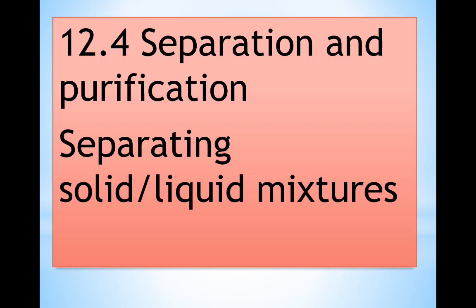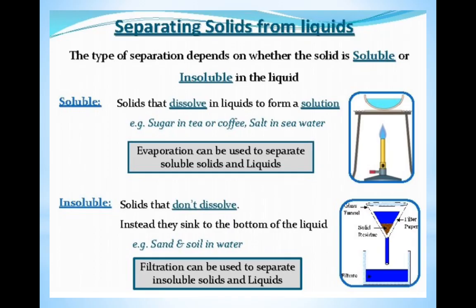Now we'll be discussing 12.4 of experimental techniques and analysis, which is separation and purification, as well as separating solid liquid mixtures. Separating solids from liquids. The type of separation depends on whether the solid is soluble or insoluble in the liquid. Now, what's soluble and what's insoluble?